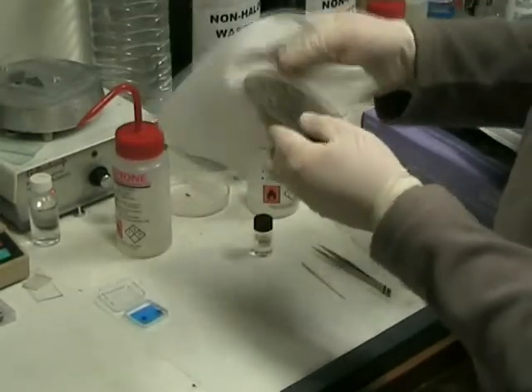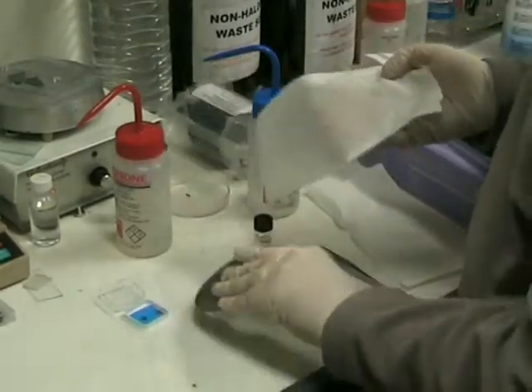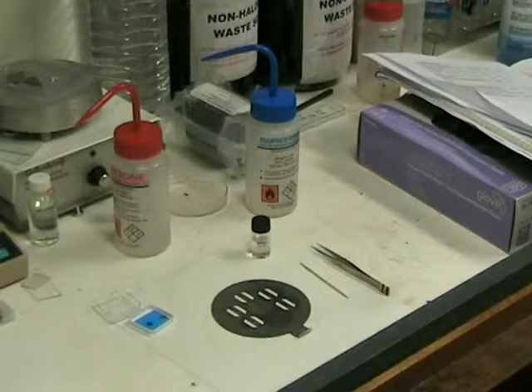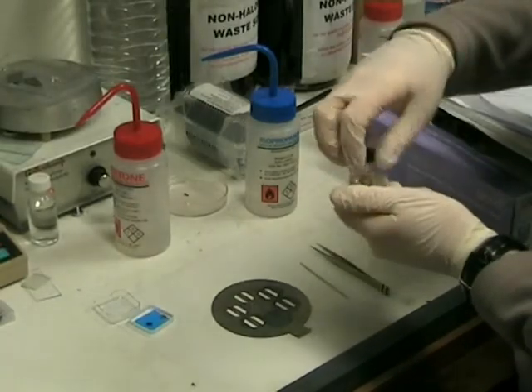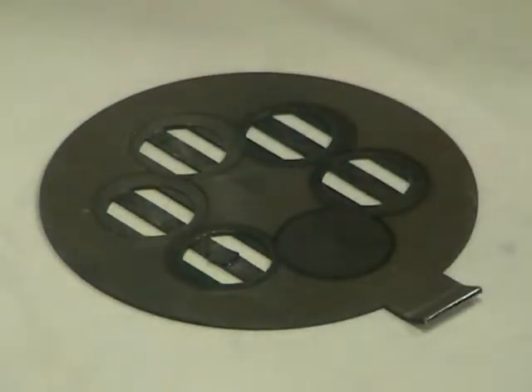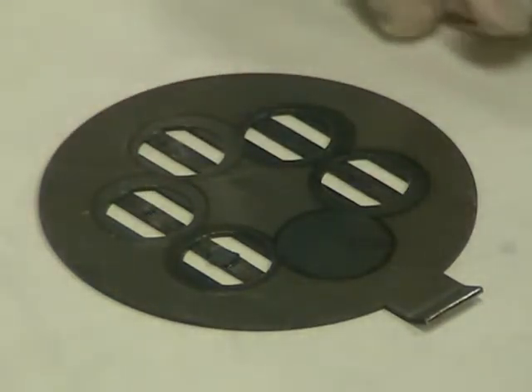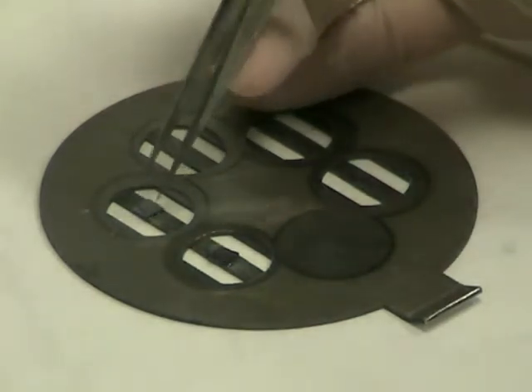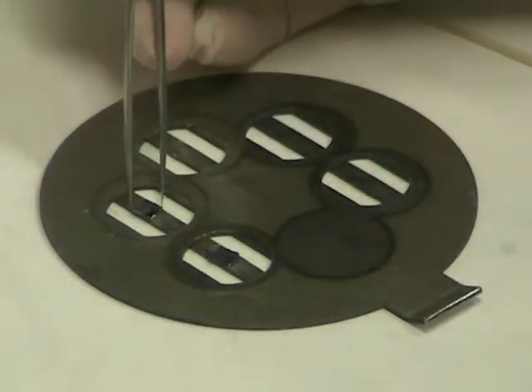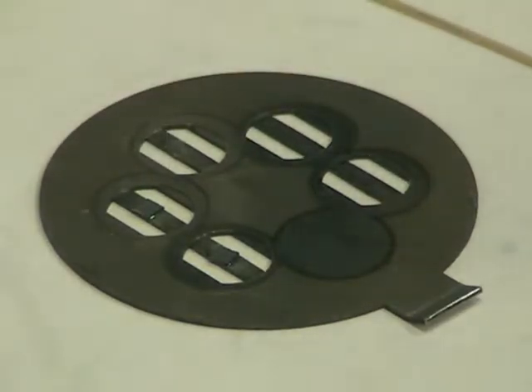The isopropanol will remove any acetone that is left on the holder surface. After wiping, dispose of the wipes. After the IPA has dried, we can stick the samples to the holder using PMMA glue. Only a small amount is needed. Using tweezers, we can then put the sample onto the holder.